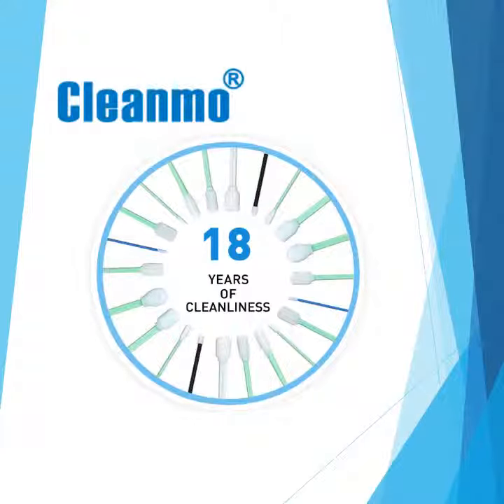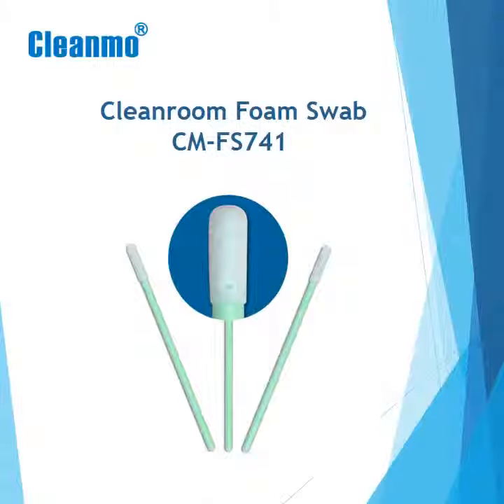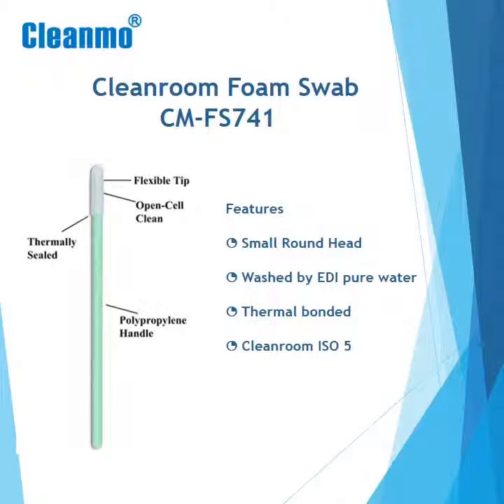Welcome to CleanMo Product Spotlight. CleanMo Cleanroom swabs are manufactured with a complete thermal bond, eliminating adhesive contamination. This video features the FS741 swab with a flexible tip — your best choice for cleaning small and confined areas.